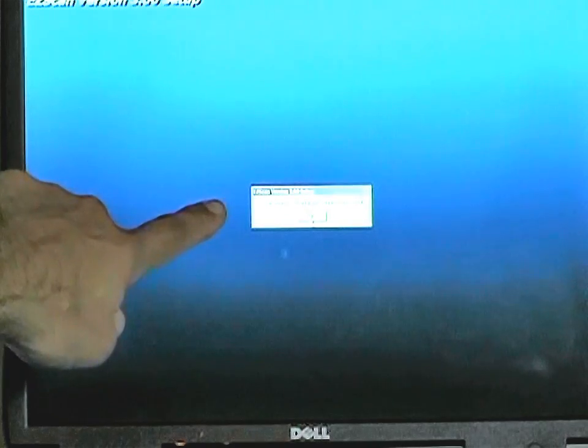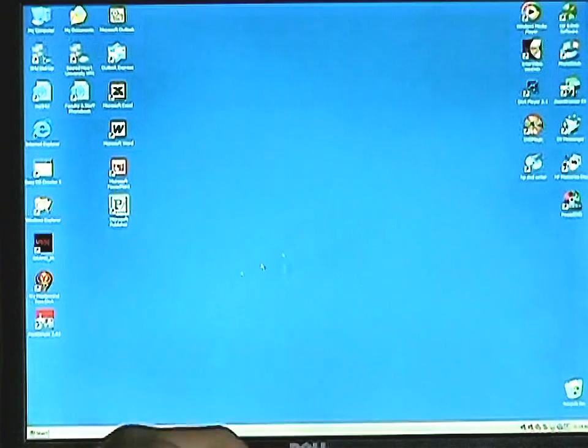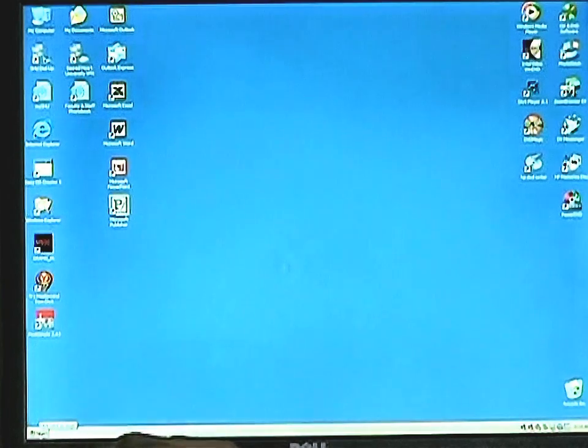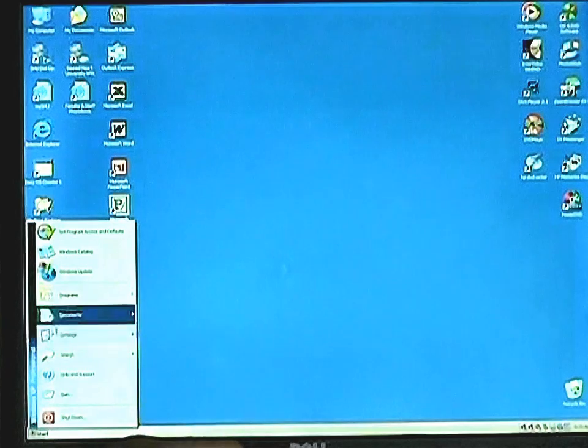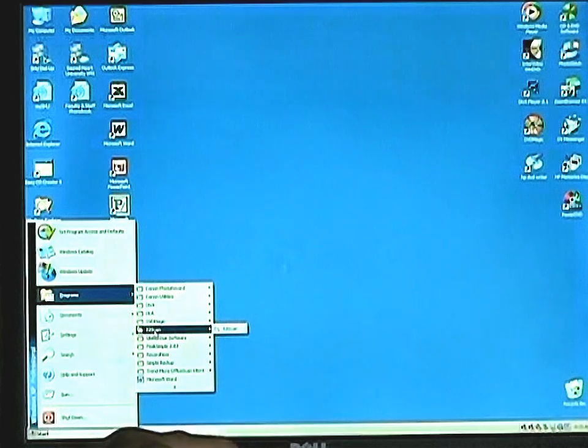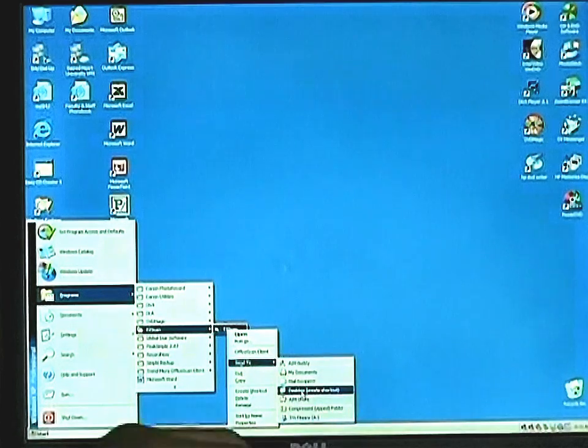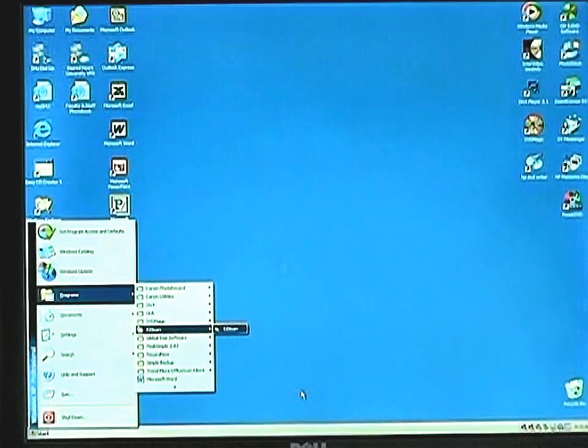After it says the setup was successfully completed, you can click OK, then go to Start, Programs, the Easy Scan group, and then copy the Easy Scan executable file to the desktop for easy operation.